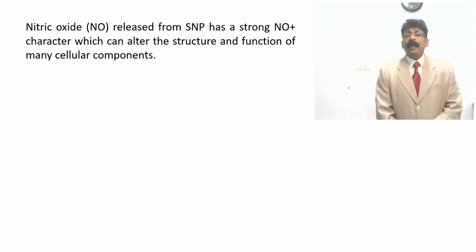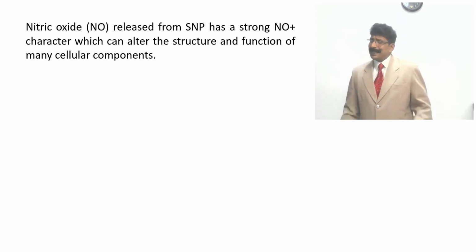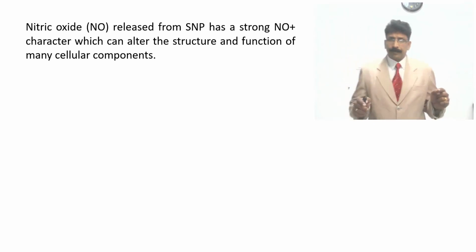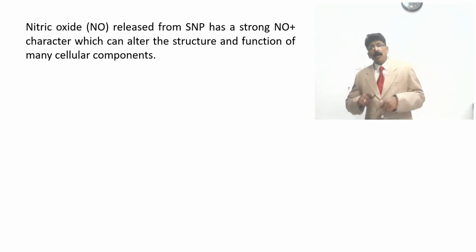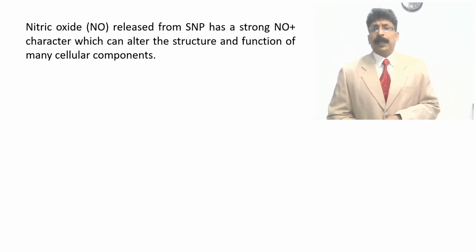And nitric oxide, NO, is released from sodium nitroprusside as a strong NO+ character, which can alter the structure and function of many cellular components.